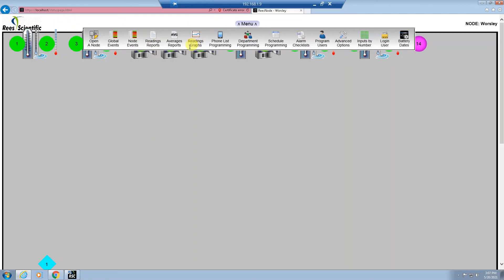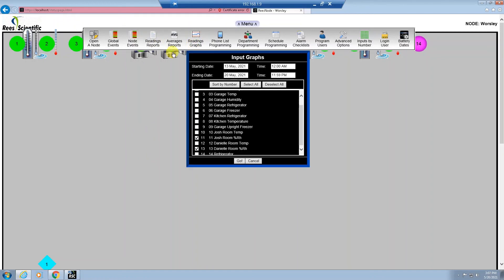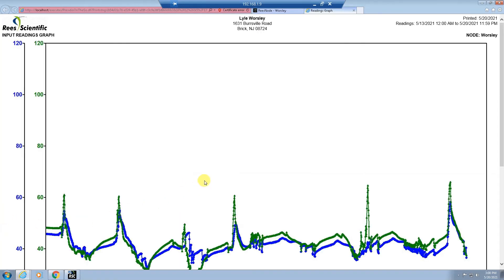Selecting readings graph will allow you to have either a single, multiple, or all inputs comparison graph on the screen. Select your date range and your inputs and hit go and your graphs will show up in a separate tab. You can then look at the comparison of the two graphs. To print this graph, either go to Control+P and hit print, or go to file and print.